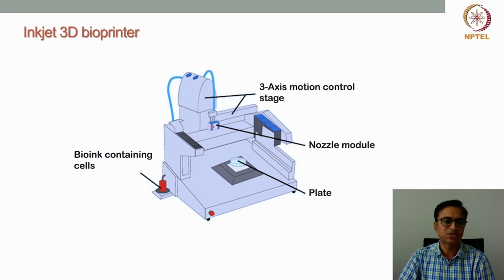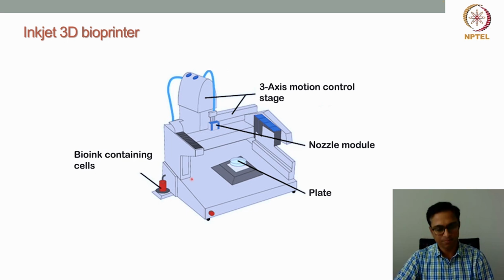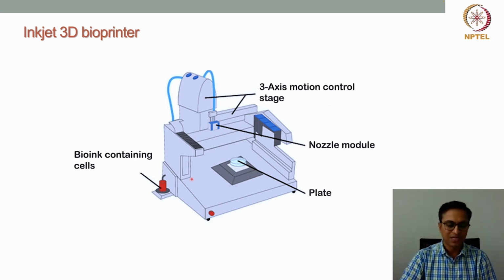So this can also go in xy, all xyz movement is possible for this printer. Similarly, now there are two changes here. In our printer we have used some cartridges where some inks are there for printing, suppose for printing few text or maybe printing images, right?